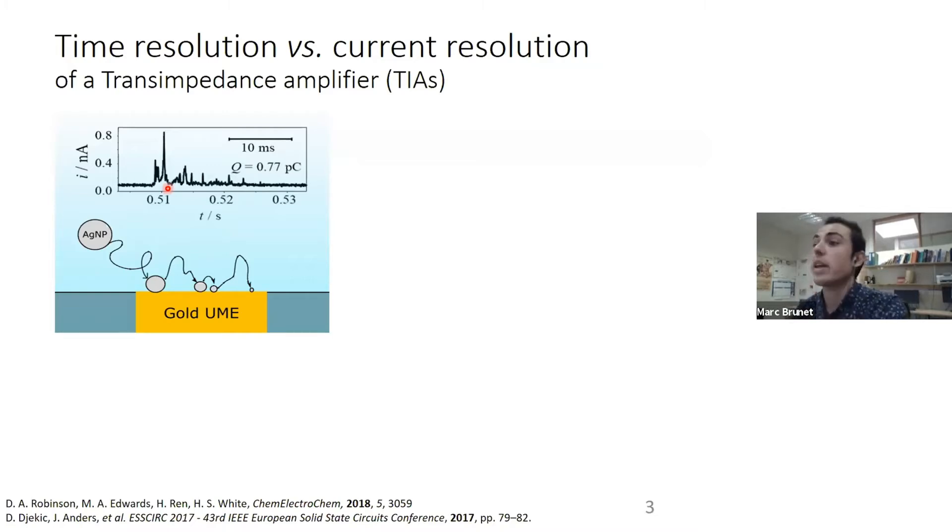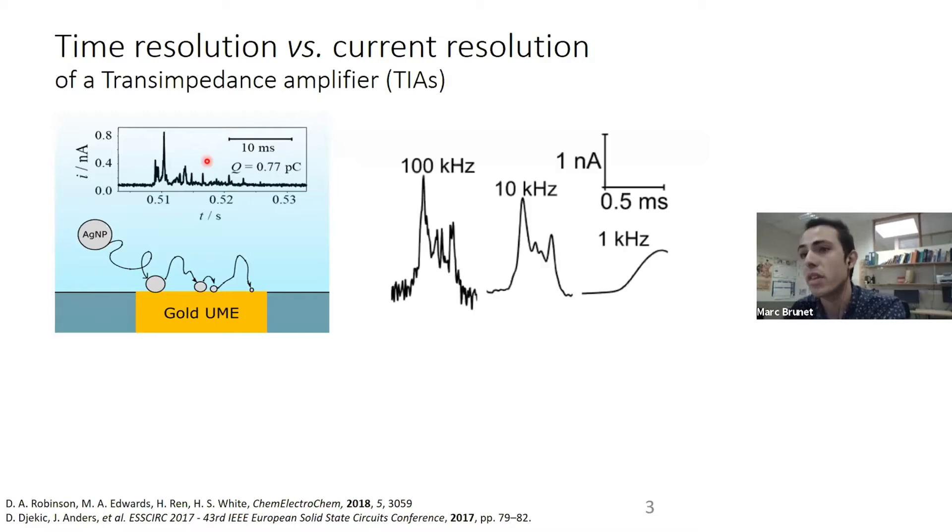These types of signals that are very characteristic for single nanoentity measurements are pretty difficult to process from an instrumentation perspective, because normally the current amplifier limits the temporal resolution we can have in those types of measurements. For instance, here in the second figure, we see how by using too low bandwidth current amplifier and too low bandwidth to store the signal, all the information that we initially have is completely lost.